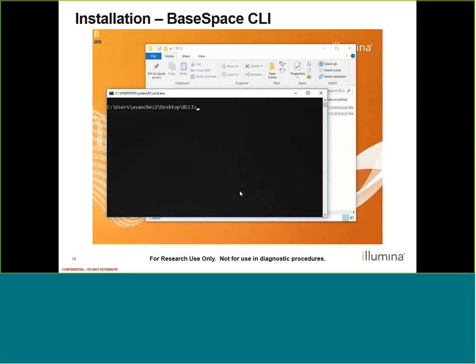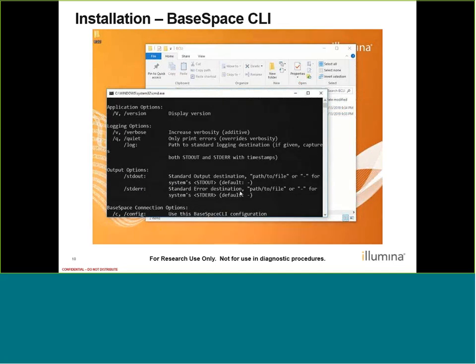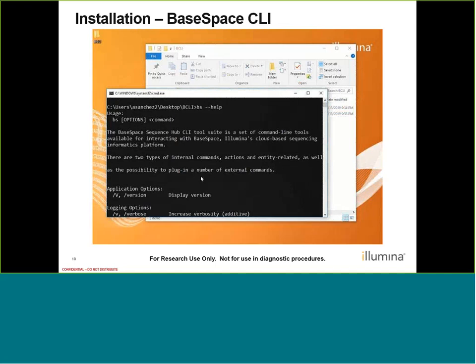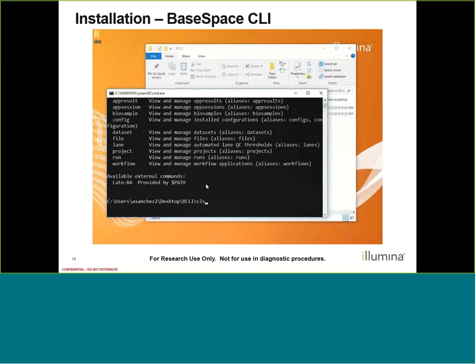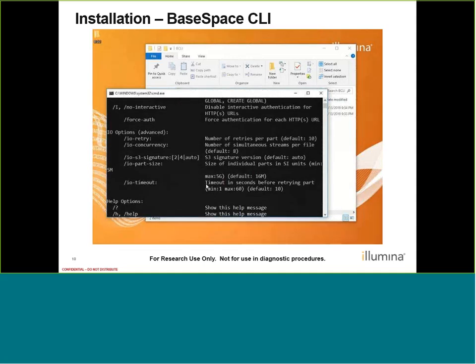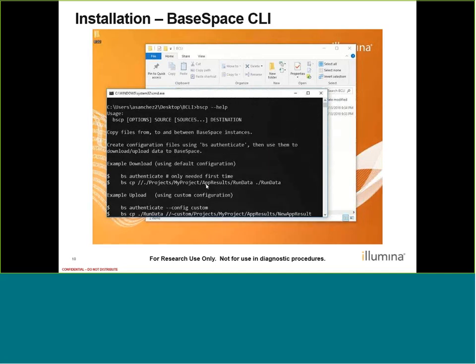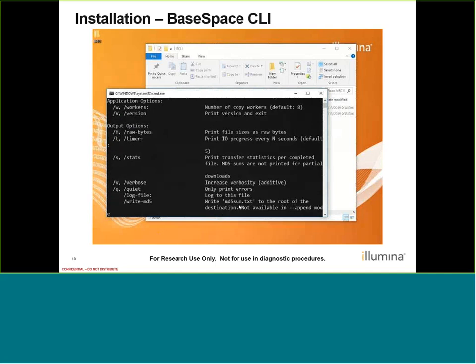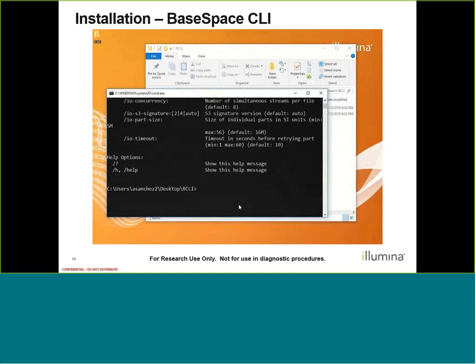I don't have to actually grant permissions because I'm working in Windows, but you would have to in Mac and Linux. Here I typed BS --help, and that just ensures that I'm able to see all the help options, meaning that I have the scripts available to work with. It also shows me how I'm supposed to use this script for actual use. Let me clear this, and I'm going to do the same thing with the BSCP script — I'll type --help so I can see all of the different options that I can include or use with my command, including the actual command usage itself like BSCP options.